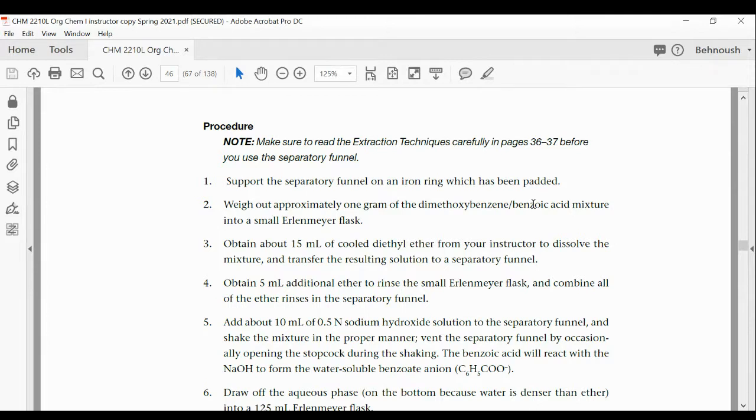You add the 2 together and divide by 1 gram times 100. That gives you the percent recovery. Or you find 0.6 for one and 0.35 for the other, it's the same thing. You have 95% recovery.